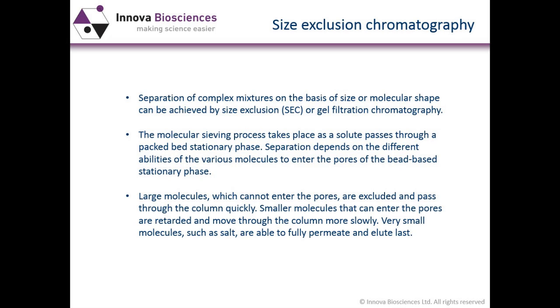Moving on now to size exclusion chromatography. This is a method where the name very well describes exactly how things work. You have separation of complex mixtures on the basis of size or molecular shape. You actually undertake a molecular sieving process.